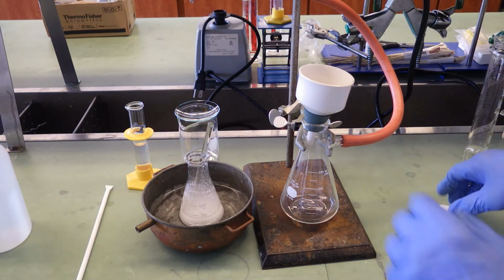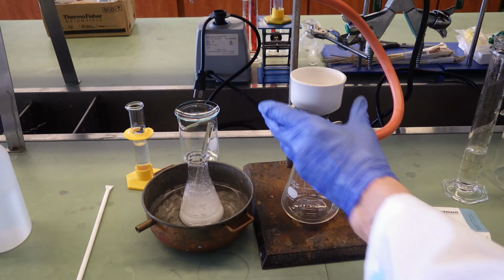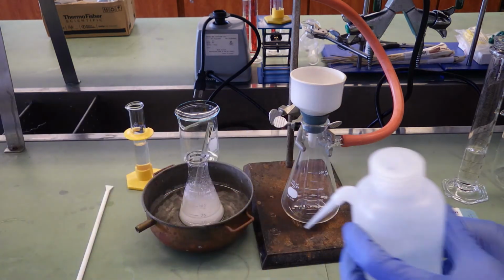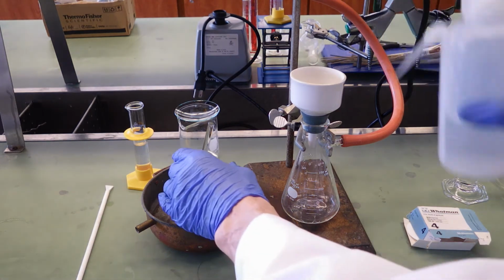Now we're going to filter this. We don't need the mass of the paper because we're going to just redissolve our solid in any case. Seat the paper so it sits flat. No solids get under it.